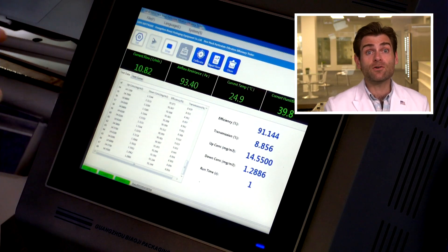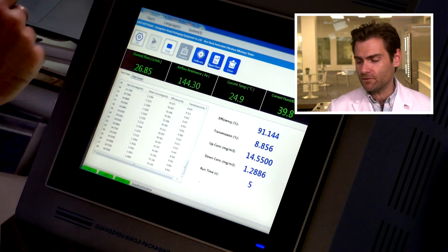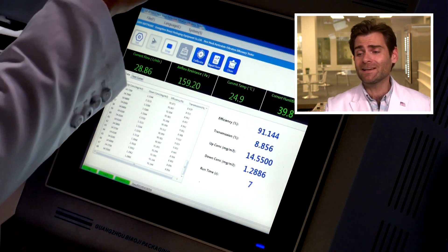Let her rip. This is a PFE machine — a particulate filtration efficiency machine. We're basically doing the N95 test to see if something would pass the N95 standard. I know you're thinking: but Lloyd, this is the CAN95.